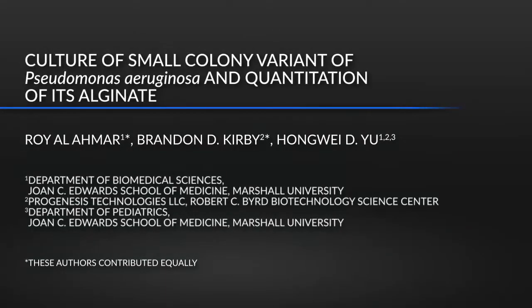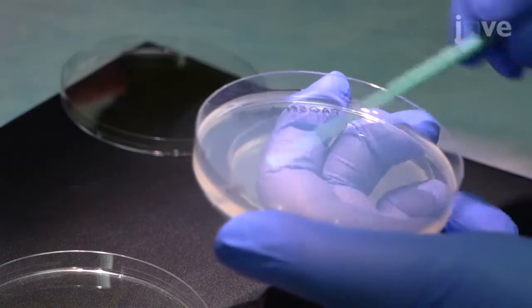The small colony variant, or SCV, technique allows for selection and growth of small colony variants of Pseudomonas aeruginosa. The method is very definitive and allows for easier selection than normal methods.